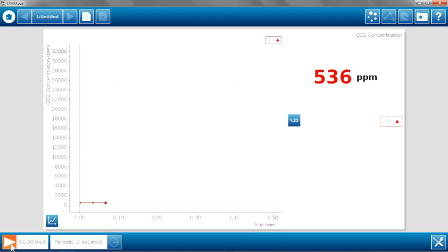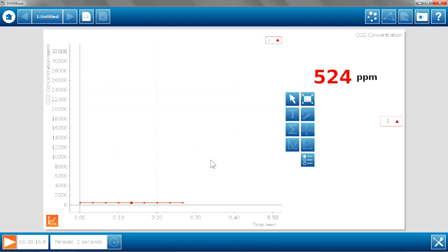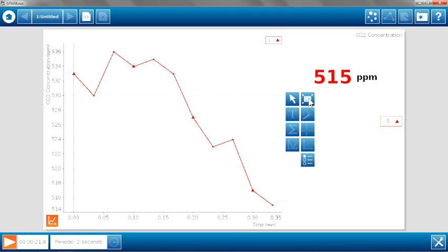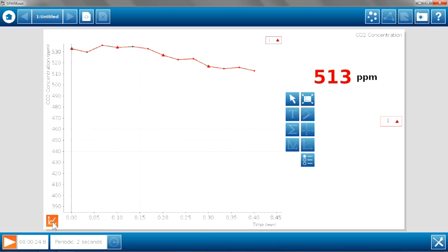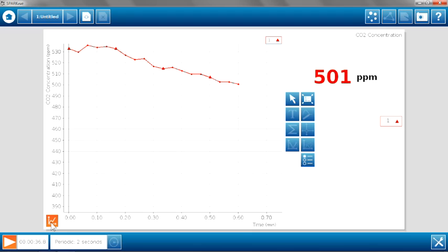Now you can see a few data points being collected near the axis of the graph there. We're going to want to scale the axes to be able to see the greatest view of our change in carbon dioxide concentration for the bottle. So I open up the graph tools, and I'm going to choose the scale axis button. And as the data is collected, the scale of the y-axis will adjust to the new data points. You can also see in the upper right hand corner a display of the carbon dioxide concentration in parts per million, and you can see how that is changing as time goes on.